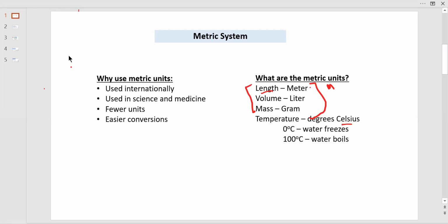Again, we're not in lab. I would have shown you the yardstick or the meter stick, and then you could put it in your hands and see it. So you don't have that, but you need some type of perspective to see what a meter is. Meter is length, right? Meter is the base unit for length.